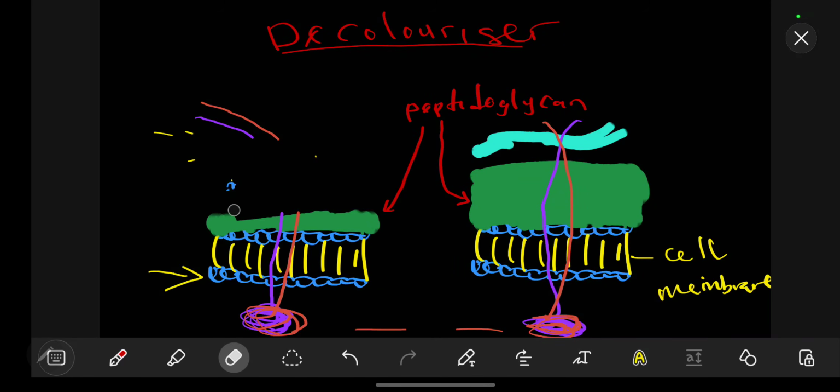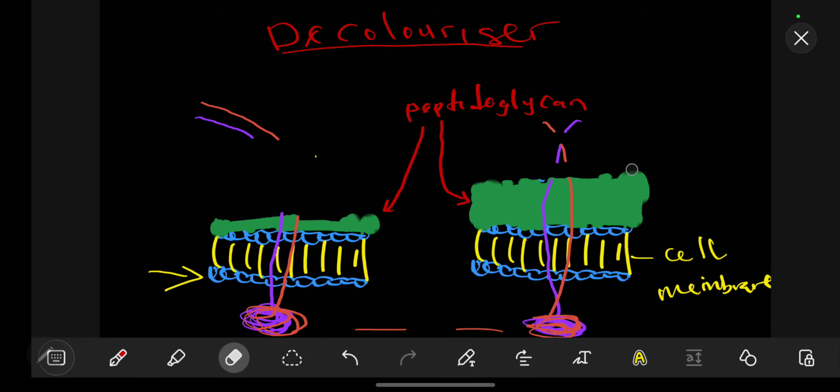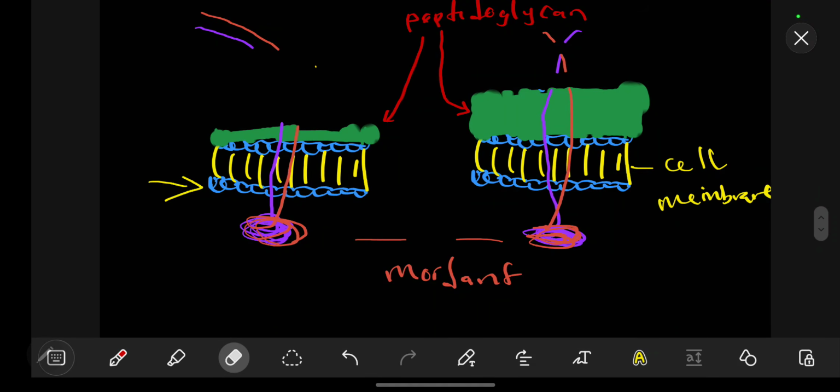So this is what we have. We only remain with a little bit of the cell wall, though it is not completely taken away. Then here the capsule is also removed. The cell wall also shrinks. But if we compare, because alcohol is a liquid, it's entering, and it will cause the substance that is here to move out.